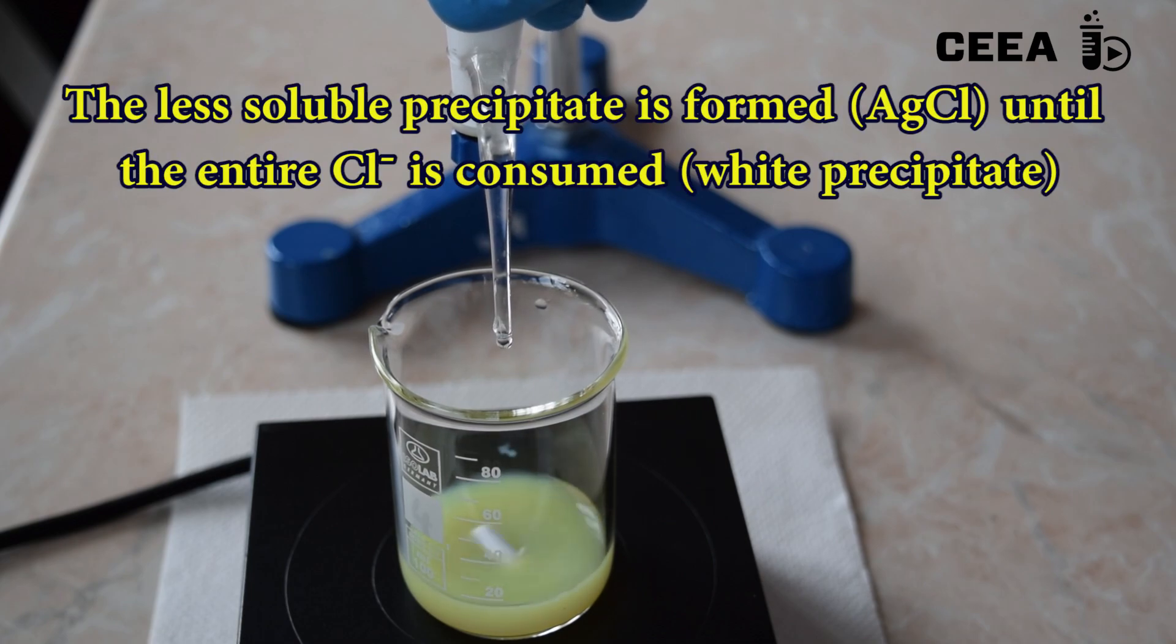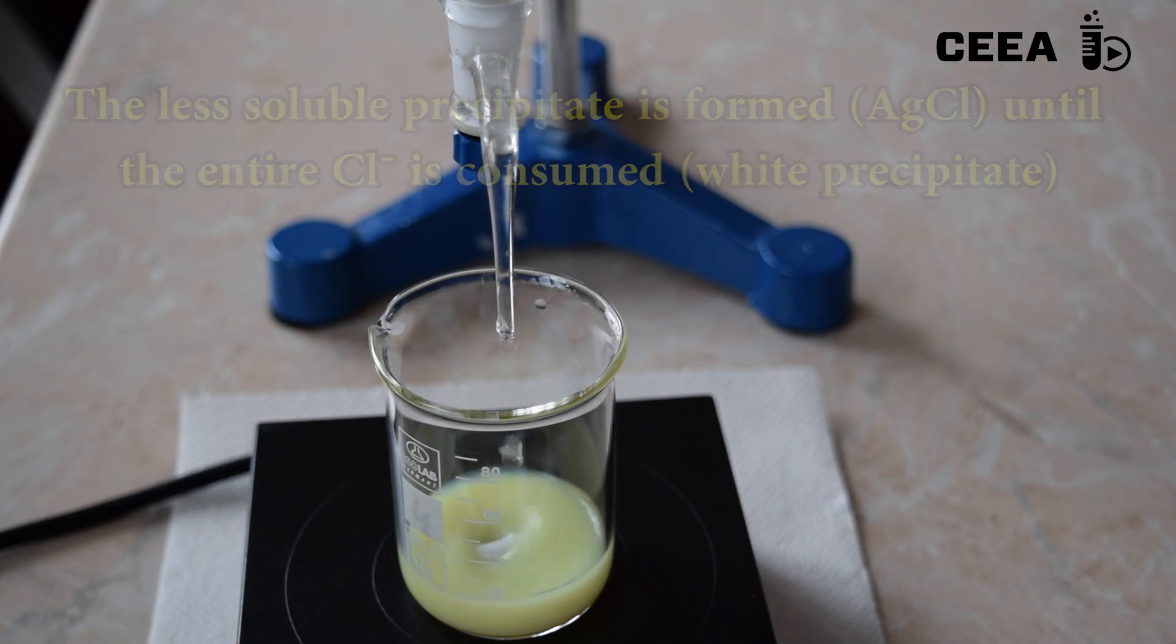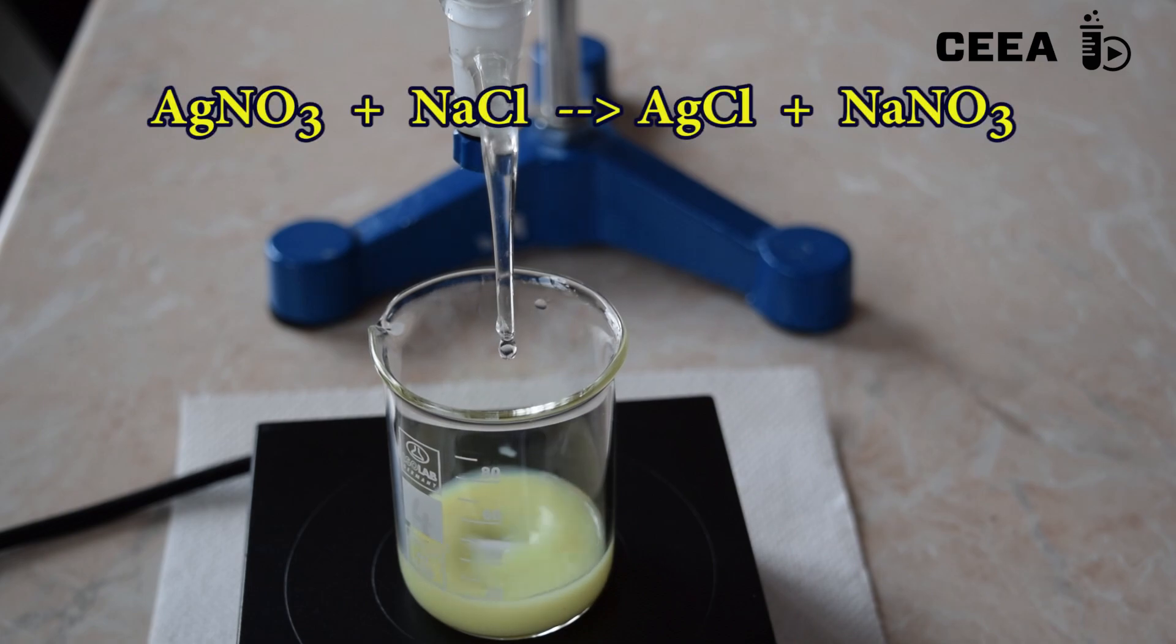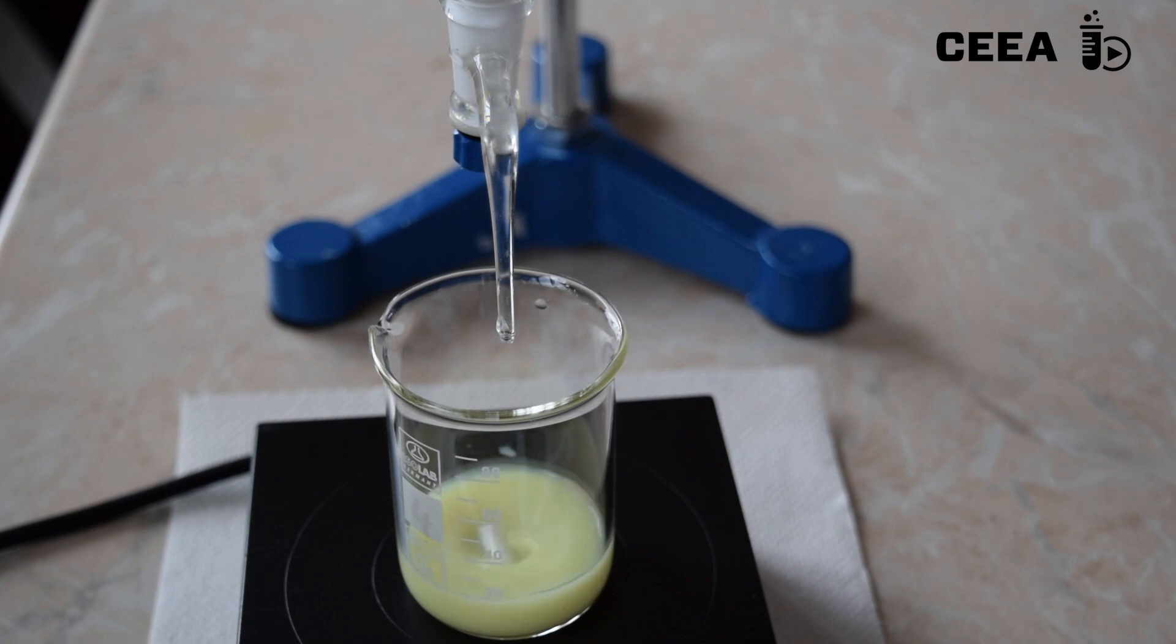Observe the turbidity appeared as insoluble silver chloride is formed. As the titration goes on, we observe the increasing amount of precipitate.